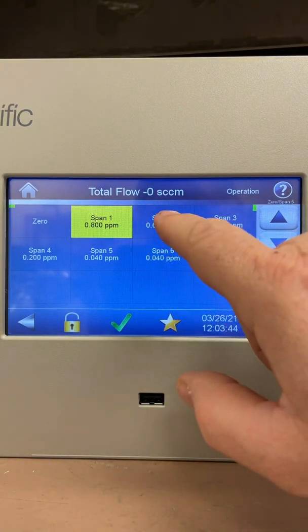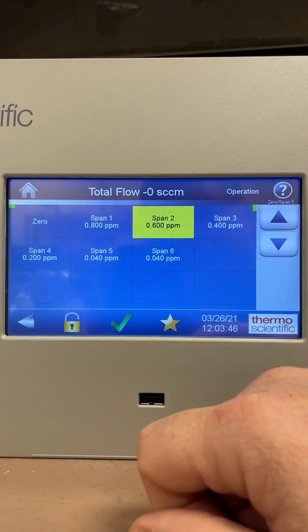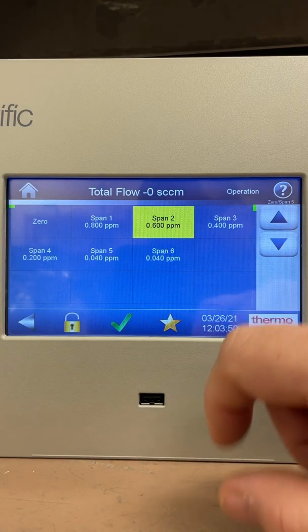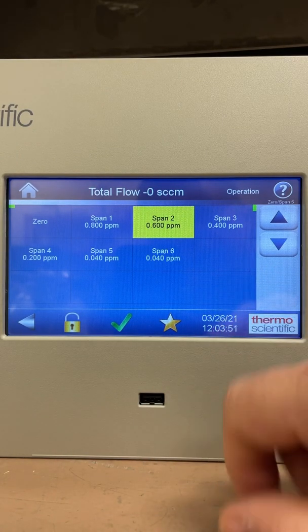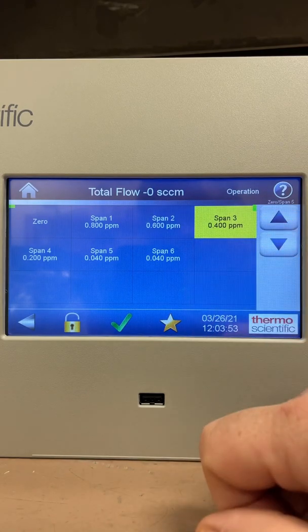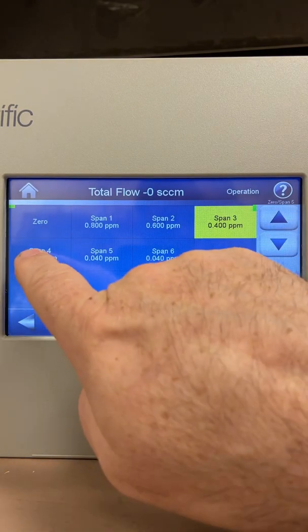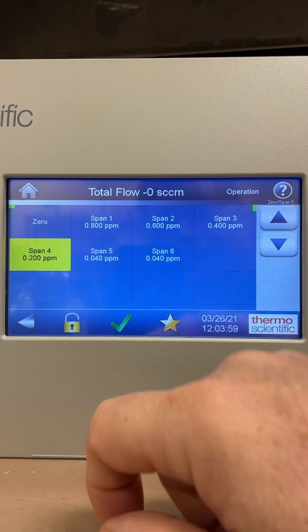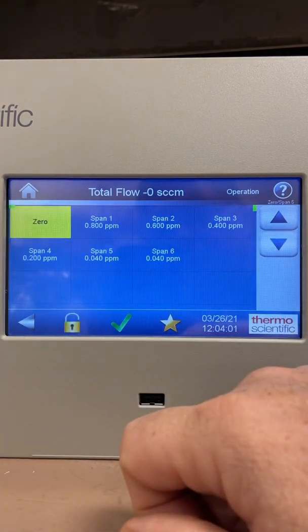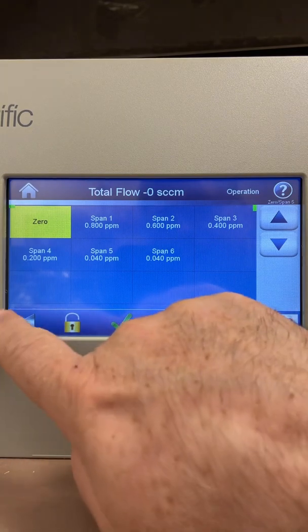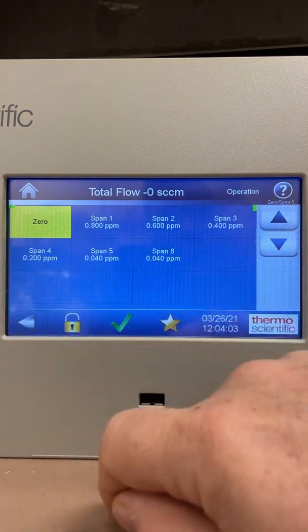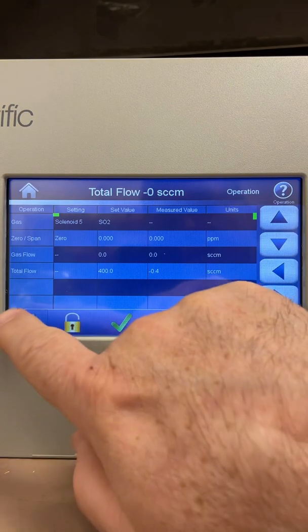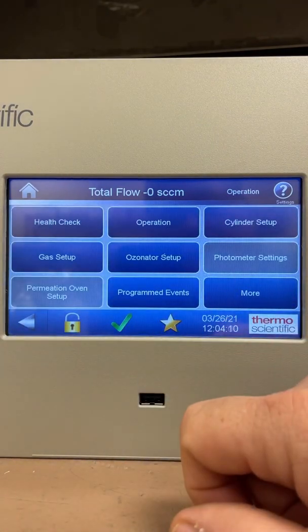Then if I want to go to span 2, my next point down is 0.6 ppm or 600 ppb. I'll hit span 2, let that run for 15 minutes, then on to span 3, and then span 4. Once I'm done with my multi-point calibration, I'll simply go back to zero and it will close the solenoid.